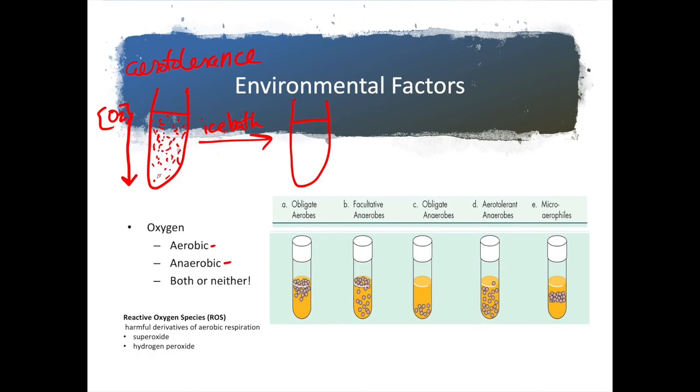Now, the bacteria that I put into the molten agar, I can't see it. My agar is still very clear. As the bacteria increase in population, they will start to cause the agar to get really cloudy. Sometimes they'll even start fermenting, producing CO2 gas, and cause the agar to crack open. Where my tube is cloudy, I have bacterial growth. If it's clear, I have no bacterial growth.